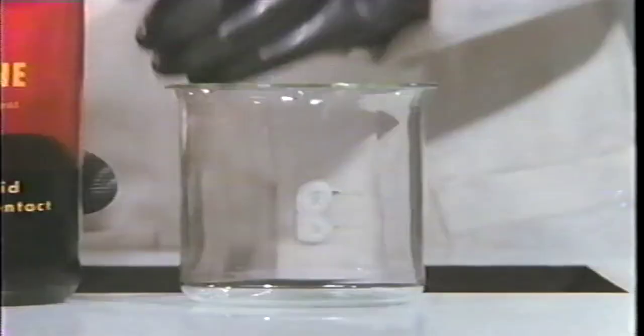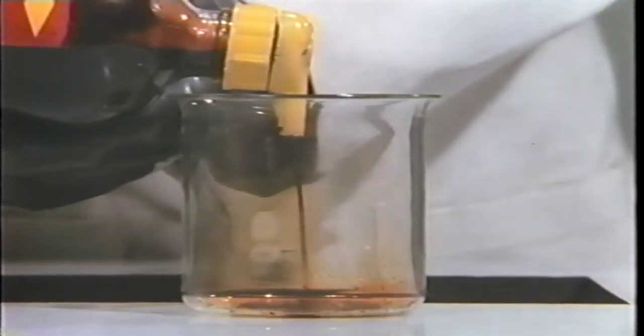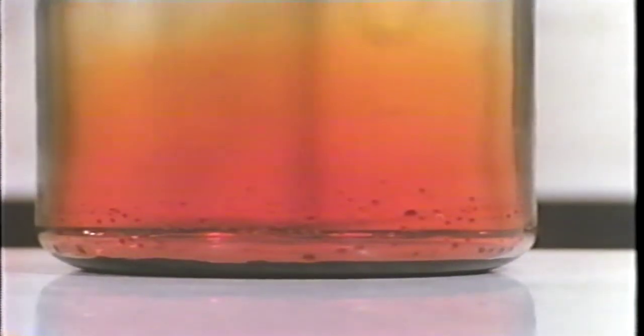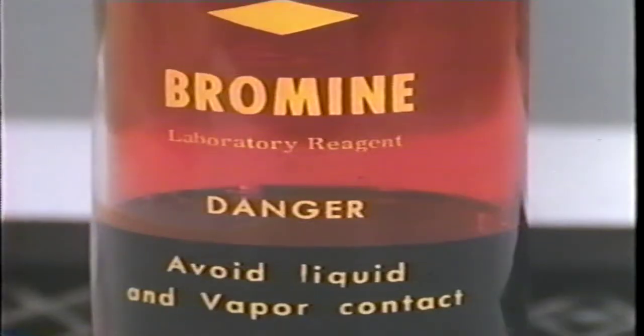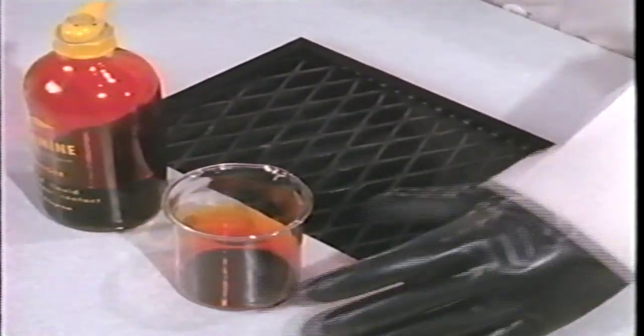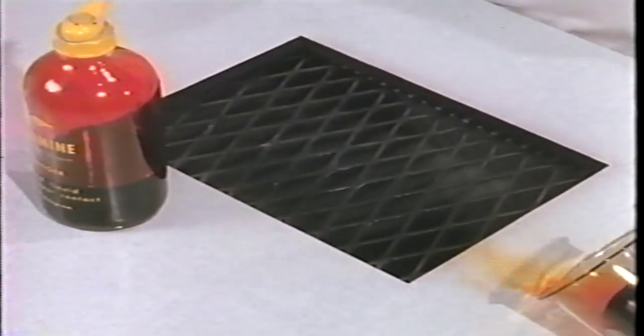To answer this question, we first explore some of the properties and chemistry of bromine. Here is a sample of the element, molecular formula Br2. Because of its high vapor pressure, bromine evaporates readily even at room temperature, forming a colored gas. Bromine is highly irritating and toxic. Special precautions must be taken in handling it, including rubber gloves and an exhaust system. Note that the gas is more dense than air.